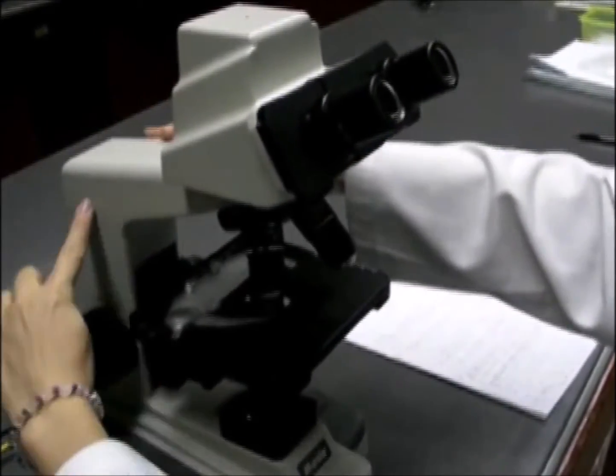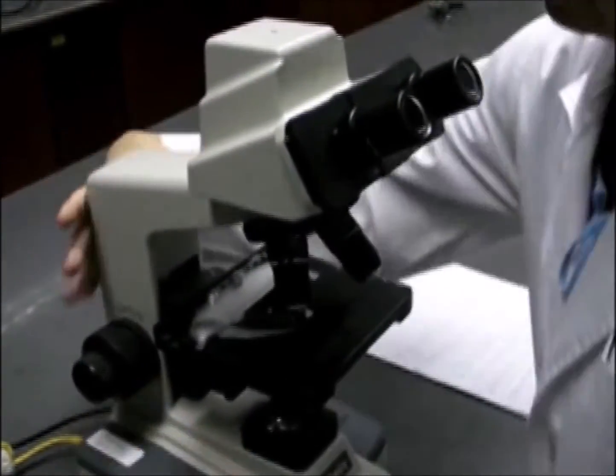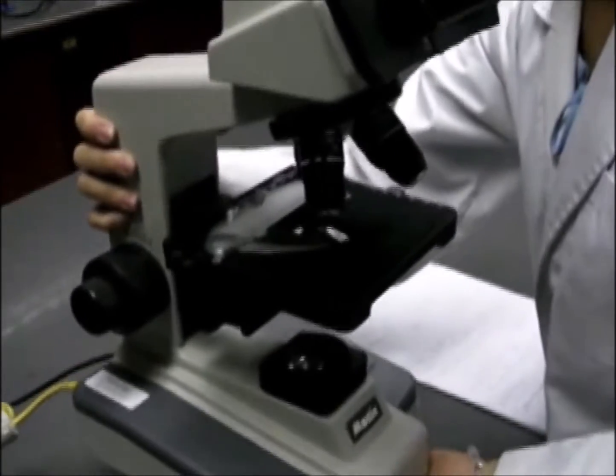This is the arm. If you want to shift the microscope from one place to the other, you will need to hold the arm and the base of the microscope in this way for the best support.